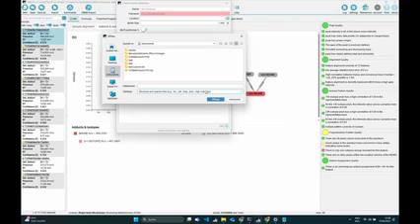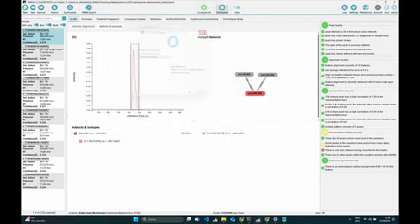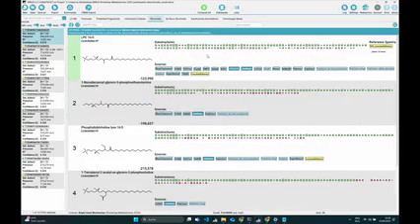So if you use a spectral database without structures, they're a complete unknown to what they are. How is that treated then? Presumably you can do spectral matches. That's something I will talk about on Wednesday. What we are doing is, since CSI FingerID is as good as spectral library search in finding reference database hits, we only search in structures.